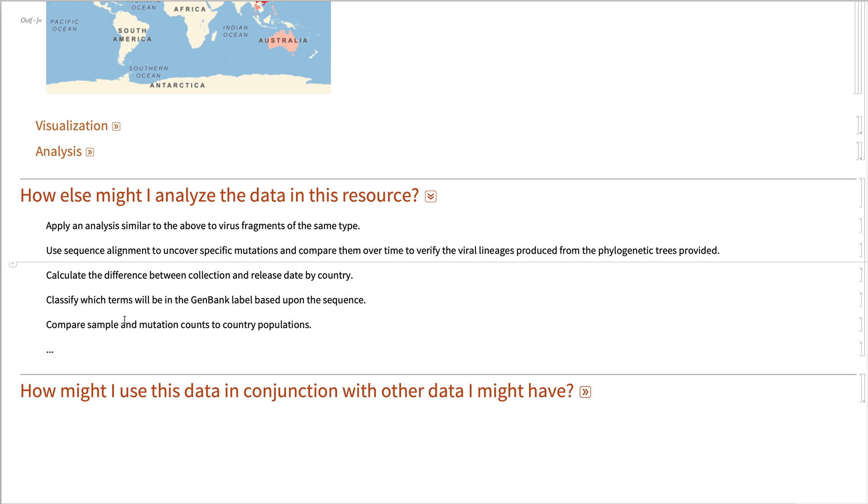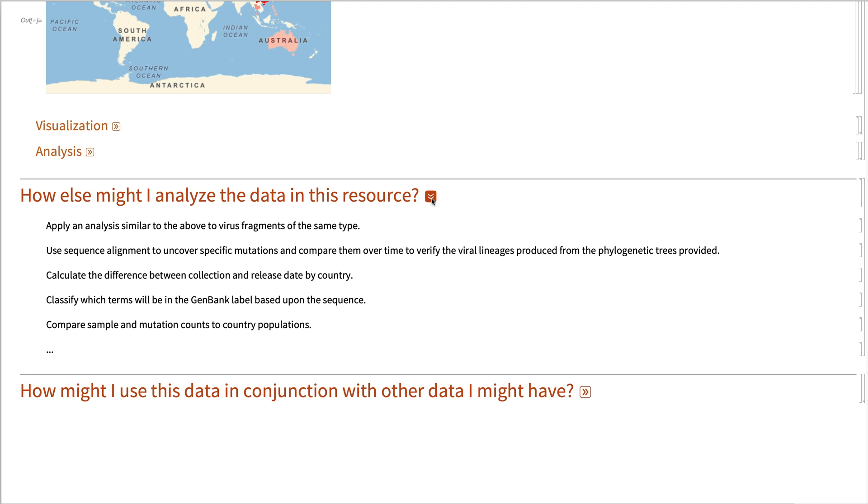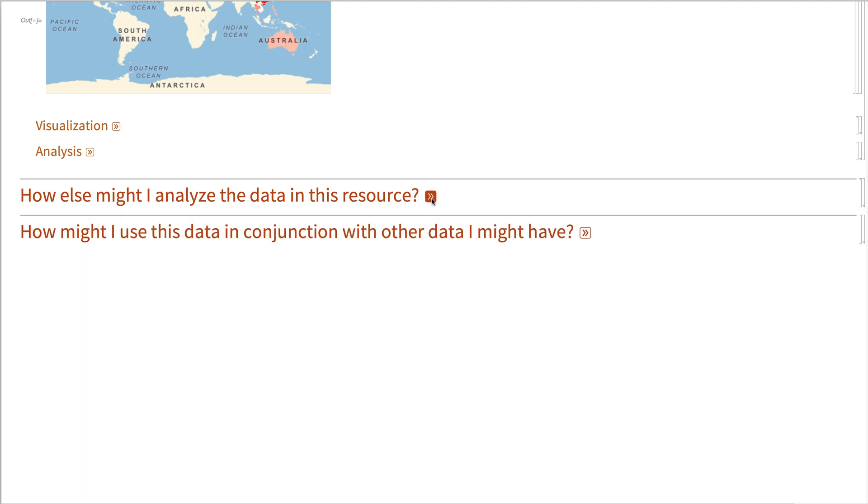And you can compare sample and mutation counts to country populations to see if that's having an influence. There's really a lot that you can do with this resource and there's probably much more that I haven't thought of. But these are some of the ways that you could consider analyzing this data.